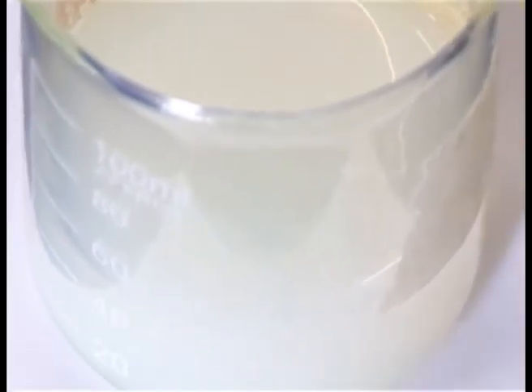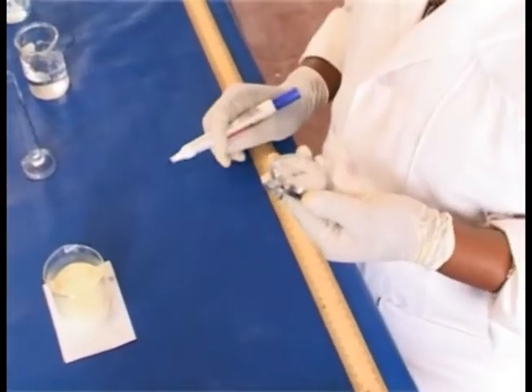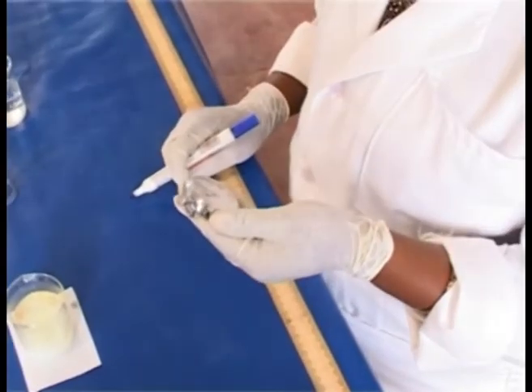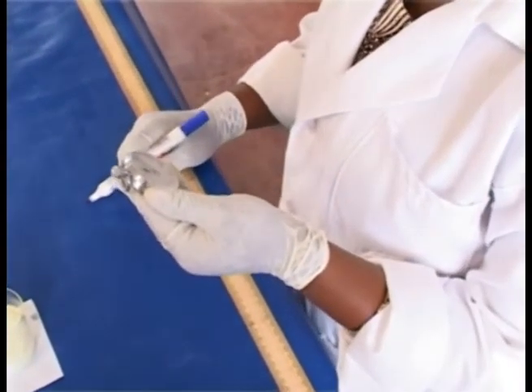Look into the beaker to see the disappearance of the mark. When the mark disappears, immediately stop the clock. The mark has disappeared, and the time taken for the disappearance of the mark is 81 seconds.